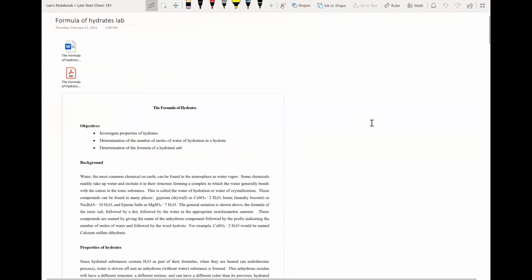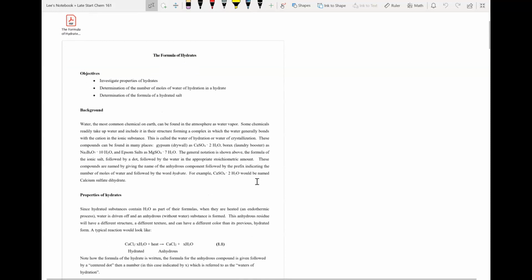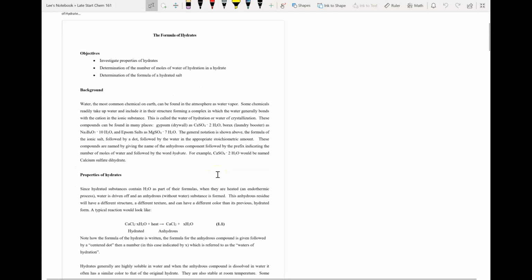So in this video, I'm going to work through and give you some pointers on the Formula of Hydrates lab. It's important to realize what a hydrate is. When an ionic compound forms, it's going to form a crystal, and sometimes as it's forming, water will get trapped within that crystal. So we have an ionic compound, and inside that are water molecules.